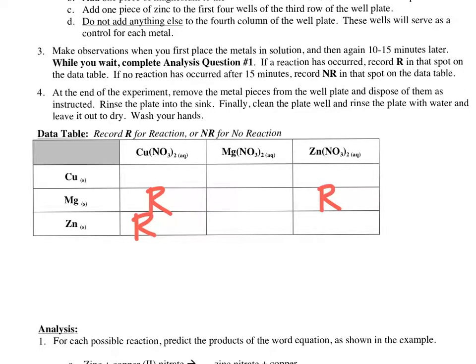If you had any other reactions, they weren't actually happening. So there's probably some contamination in that well, or some other issue. Maybe it looked like a reaction, but it really wasn't.